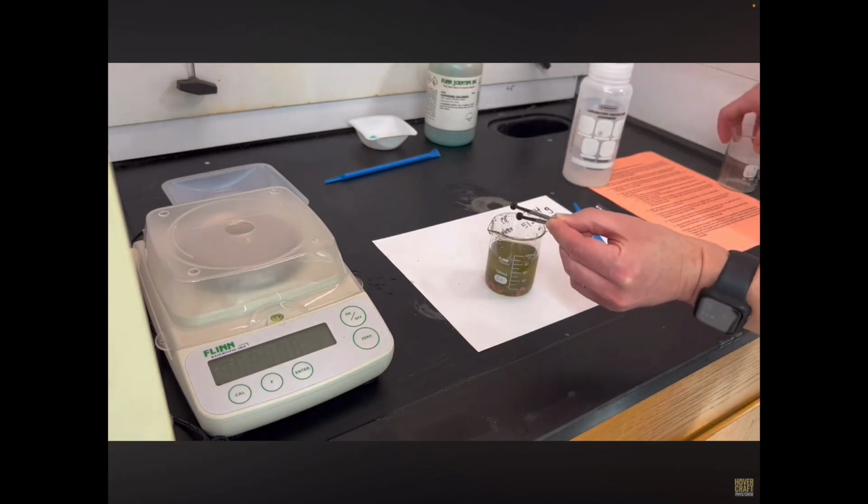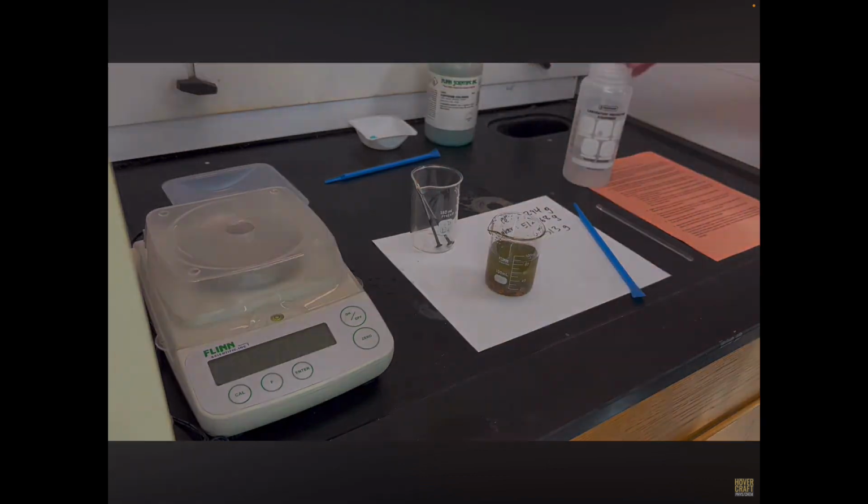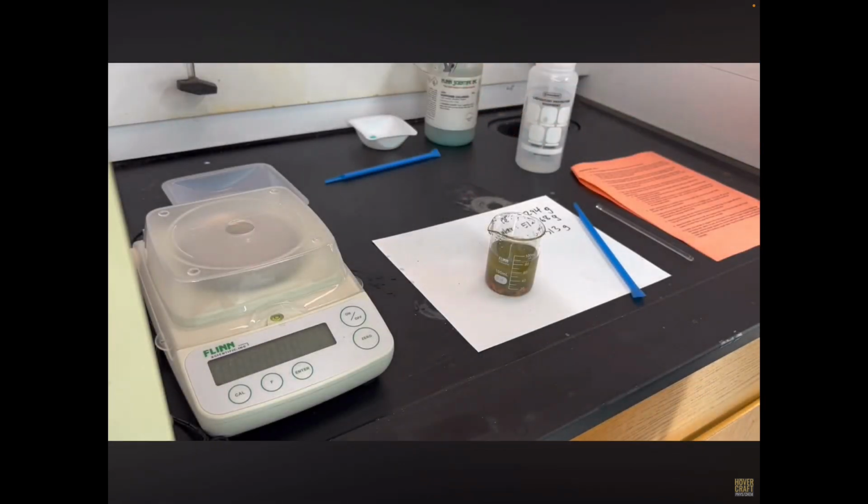You're just going to place them in another beaker. If you have a 150 milliliter beaker, that's a good fit. I'll place those there. So next up, those are going to be dried. I would like to know the mass of iron that's left.